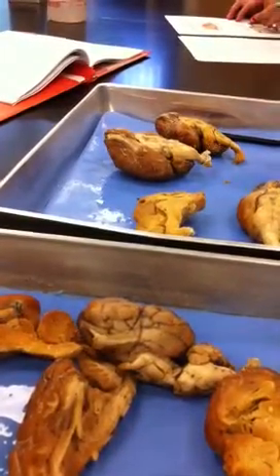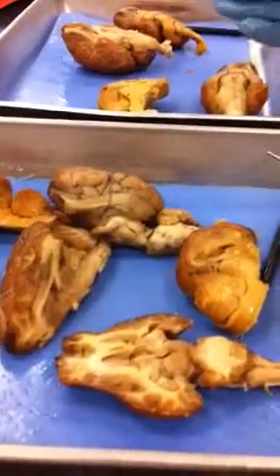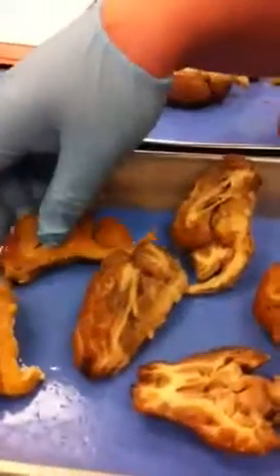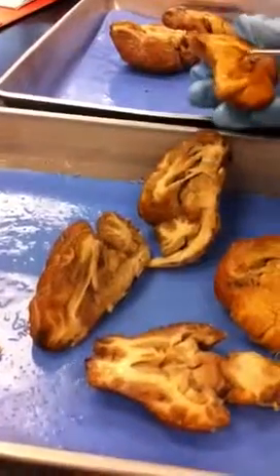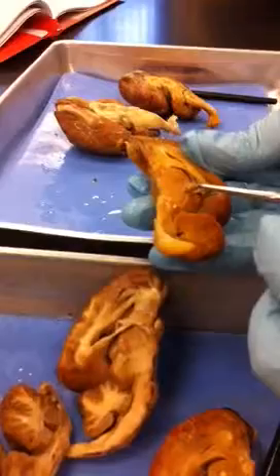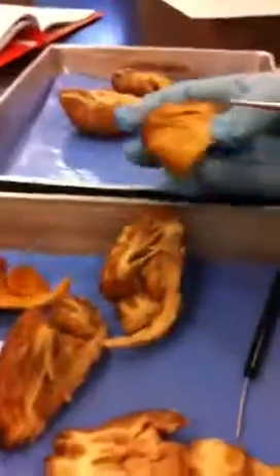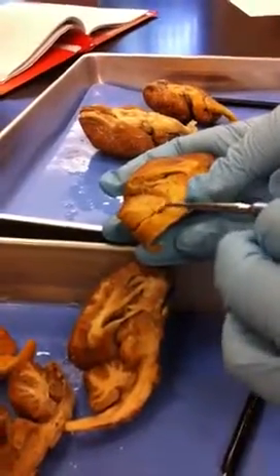Cerebral aqueduct. You have to get a good sagittal cut. You won't see it in the whole brain. To see a cerebral aqueduct, you got to get a good sagittal cut, and you'll see a line running just along the back. There's a part of one right there. See that kind of opening right there? It's like a little canal from where the third ventricle was down to the fourth ventricle here. That's cerebral aqueduct. This one's got a better one. See, this is all cerebral aqueduct right here.